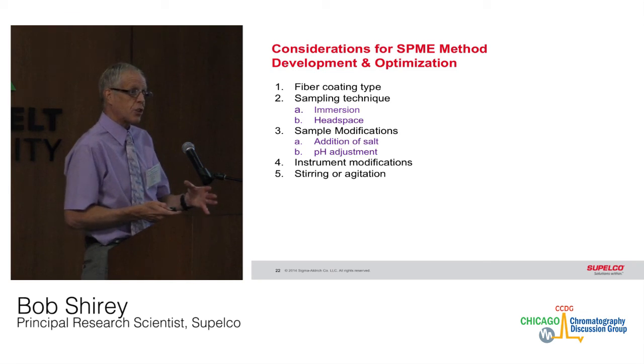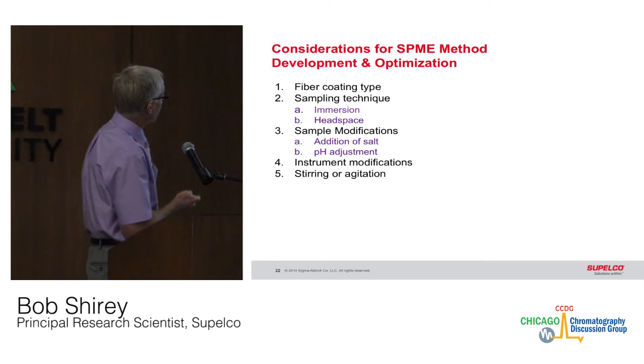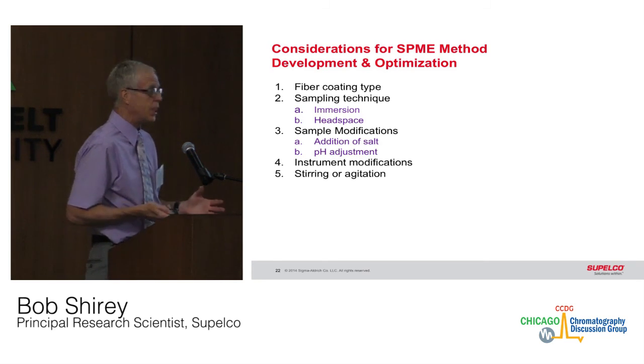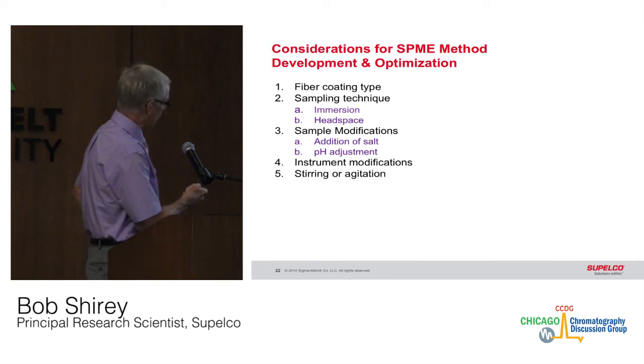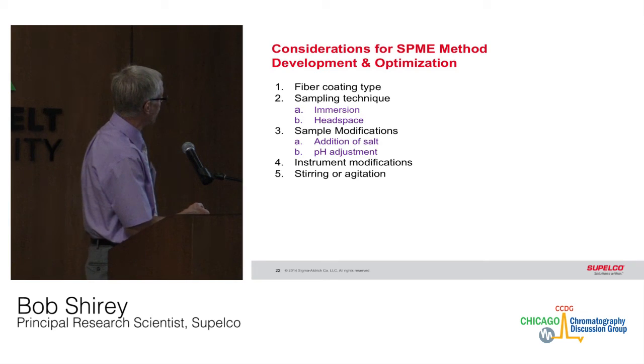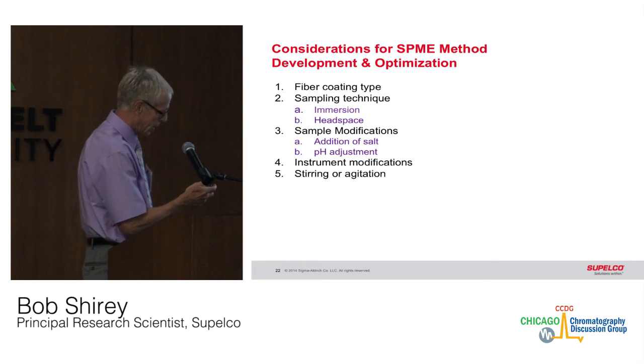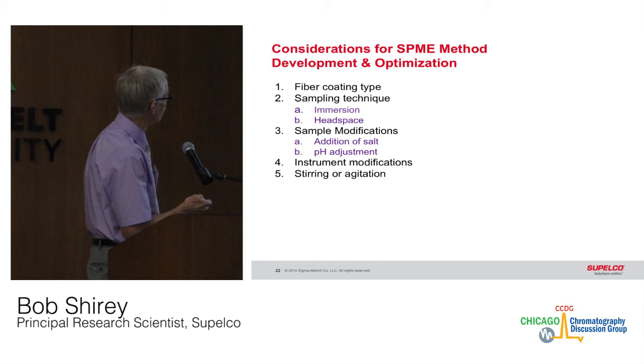Now let's shift gears a little bit and look at method optimization. How can we increase that distribution constant? Of course, the fiber coating is very important. The sampling technique, whether you use immersion or headspace, you can modify your sample by the addition of salt and pH adjustments, and some instrument modifications and the use of agitation can all play a major role.